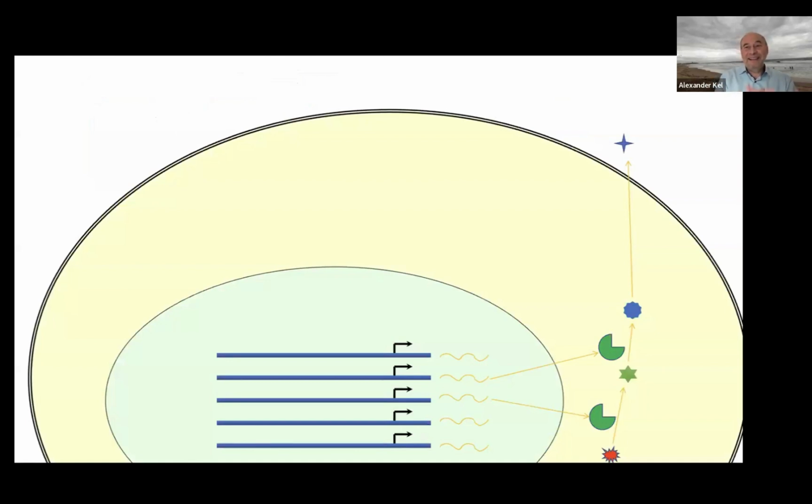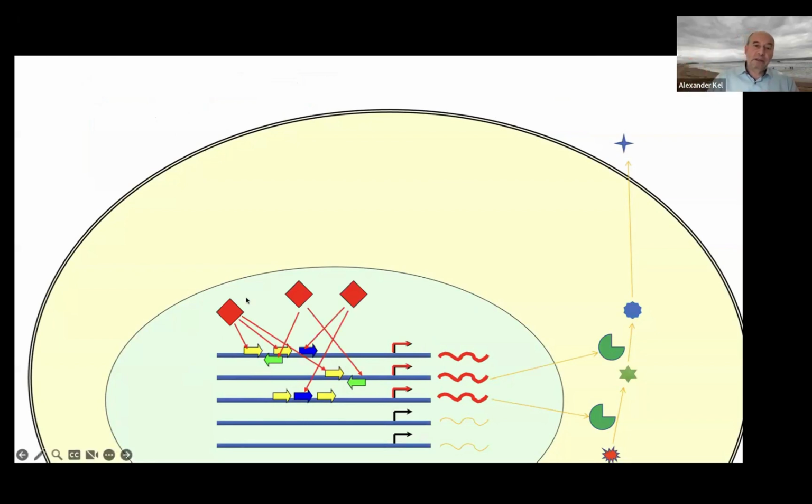I will show it quickly today. What we are talking about is what happens in the cell. There are areas of the genome which regulate gene expression, like it is shown here, and that area is detected by methods like ATAC-seq. Then we try to find the motifs for the binding sites of transcription factors. And once we have found them, from that we can assume which transcription factors, acting in the nucleus of the cell, can bind to those places and regulate the genes.